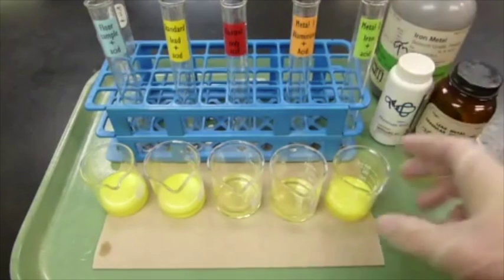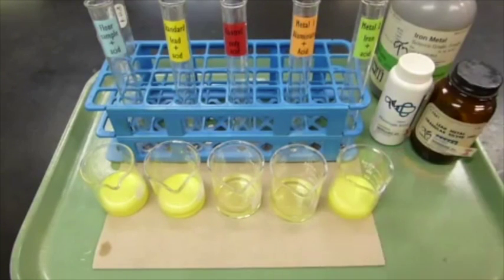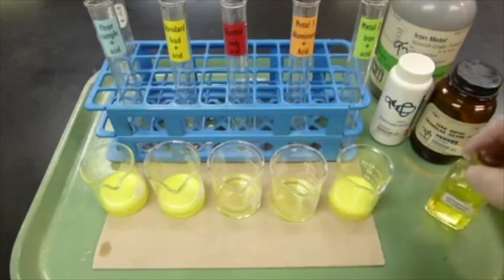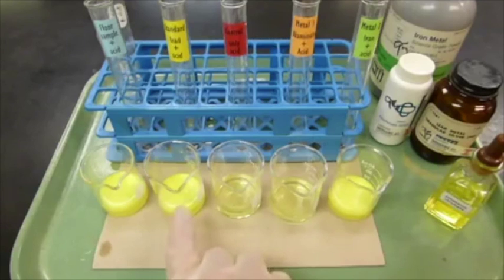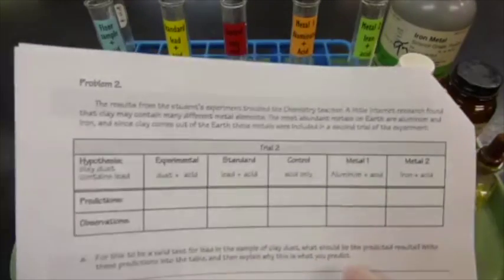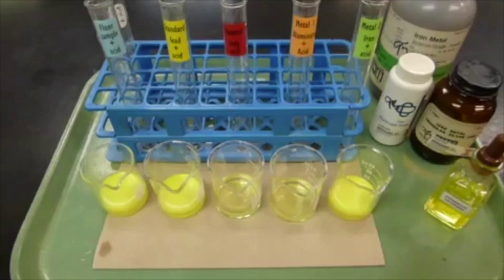oh, that's interesting. So the reaction on the iron is a positive reaction, negative for aluminum, negative for the control, positive for the standard, and positive for the floor sample. So record your observations, and then you'll need to interpret these results and what they mean about the ability to detect lead in the sample that came from Mr. Kiekefer's floor.